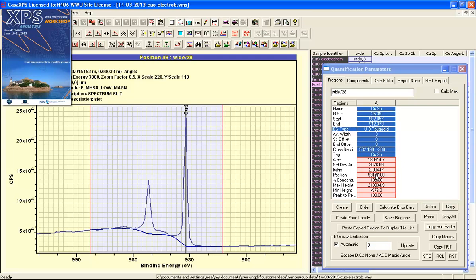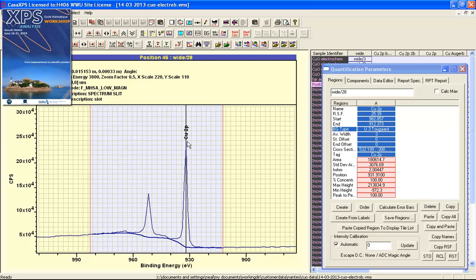The position of the peak is another parameter that is reported, and this corresponds to where the vertical line appears when the region's property page is topmost, and this is calculated based on the data bins unless you tick this box here which says calculate maximum, and the maximum intensity is then calculated using a quadratic fitted to these data, so you tend to find more precision when you have noise in the data that might influence the position of the peak if you tick the box here. Otherwise then you will obtain precisely the peak position at one of the data bins.